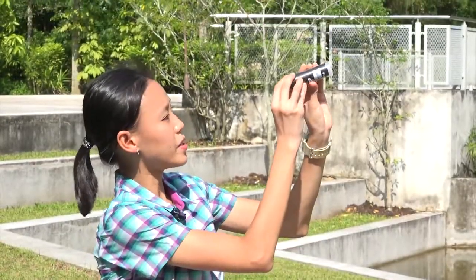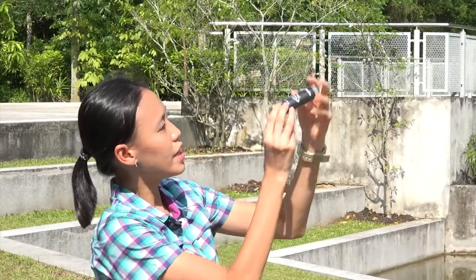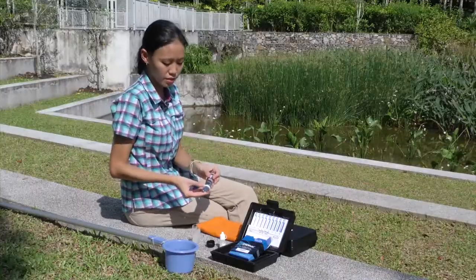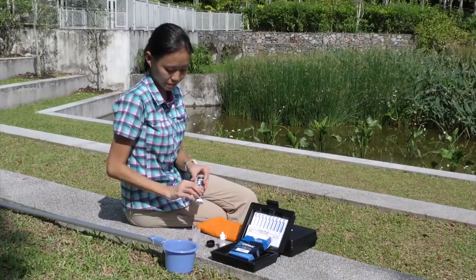Rotate the comparator until you find the best colour match. In this case, we can see that the colour falls at about 0.1 milligrams per litre. If the colour of the sample falls between the standards, it is okay to estimate the sample value.